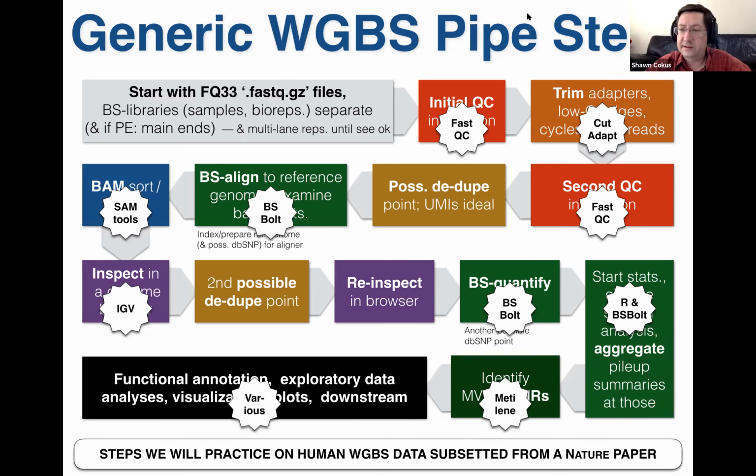I cut it down to 6 and only chromosome 21, the smallest human autosome. The data is still not trivially small, but that gets it down to something we can manage online, hands-on during our 3 hours.